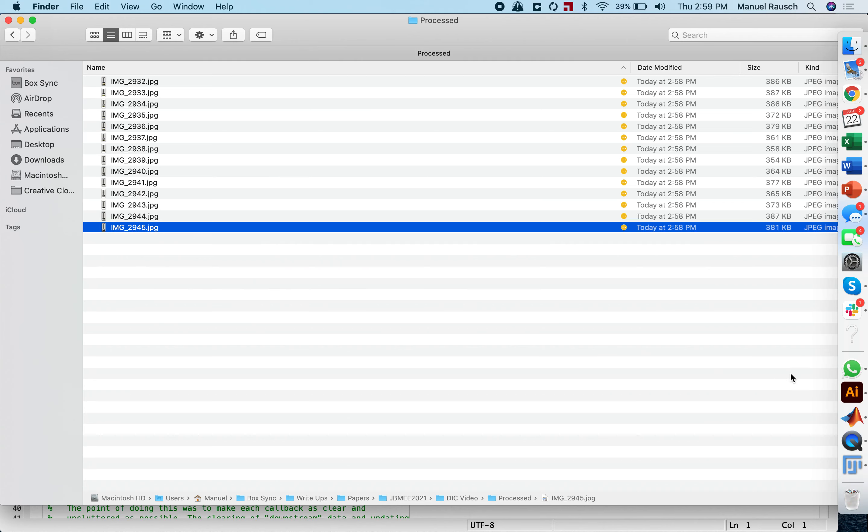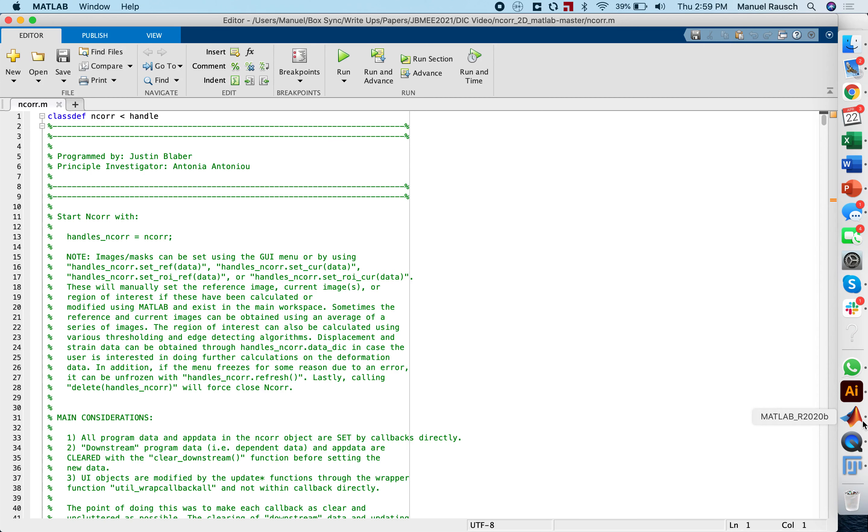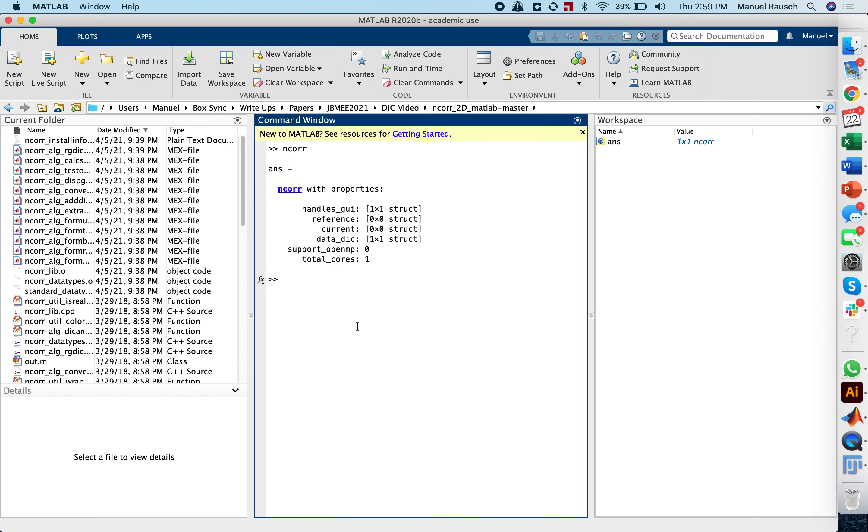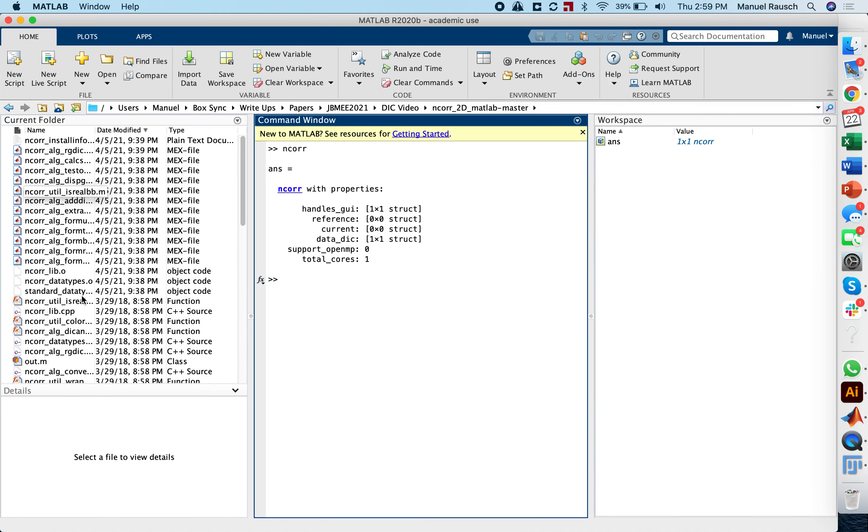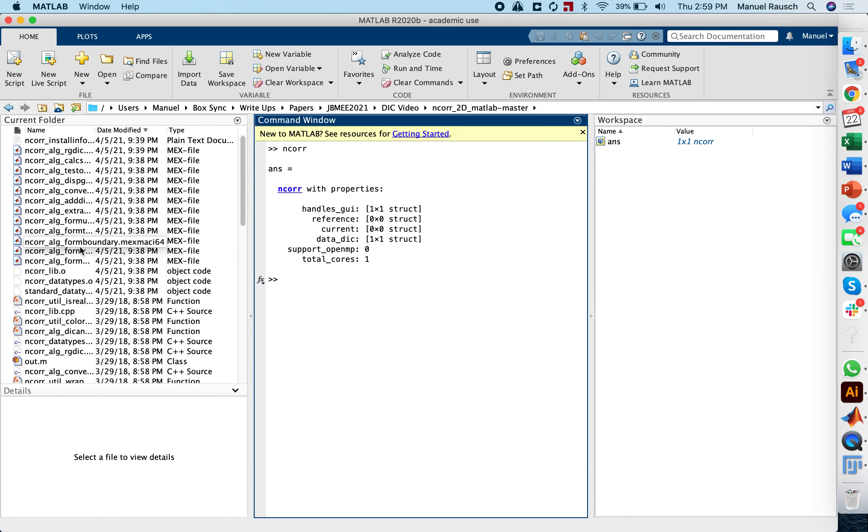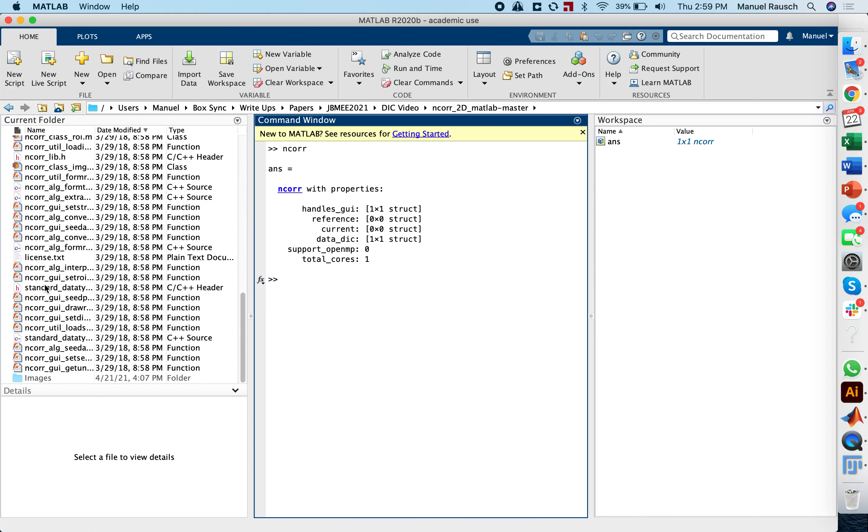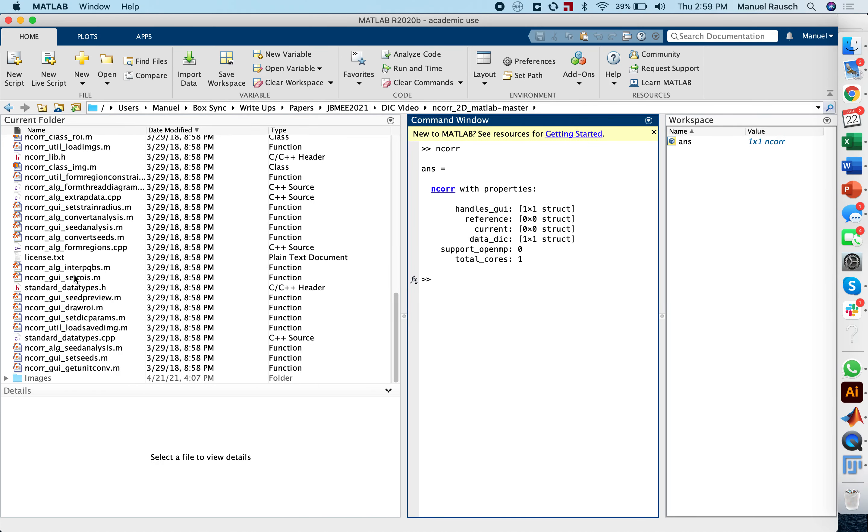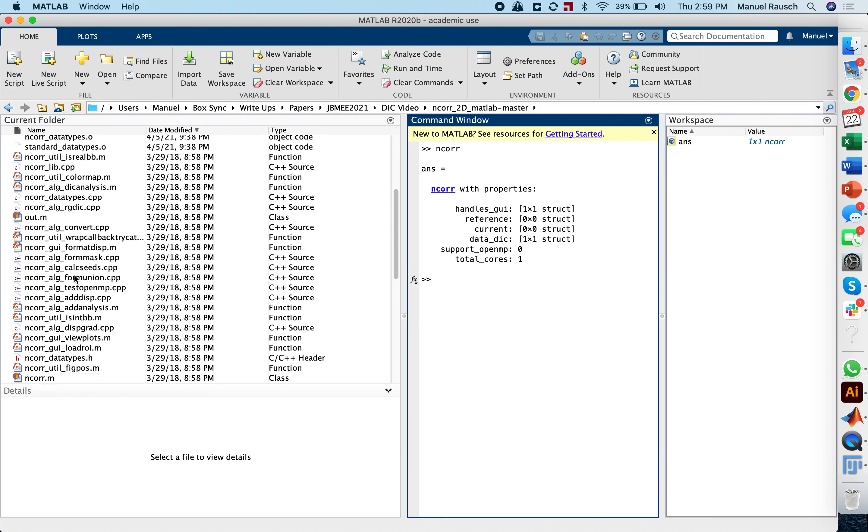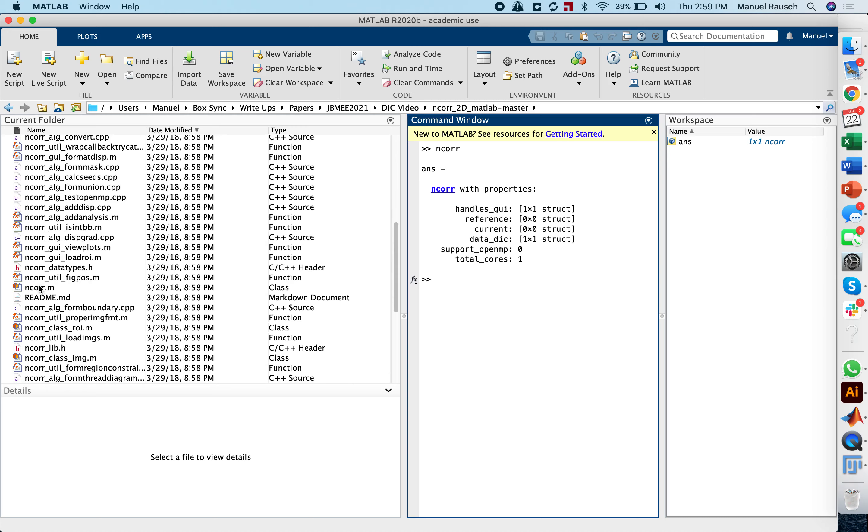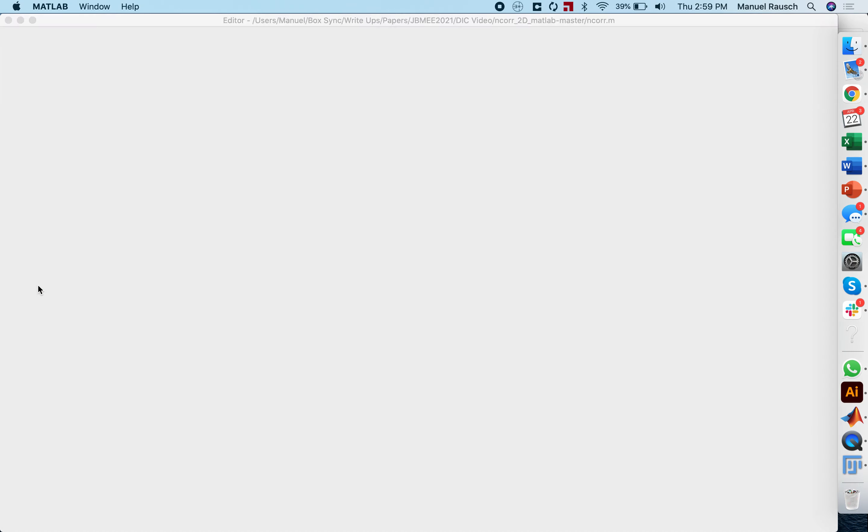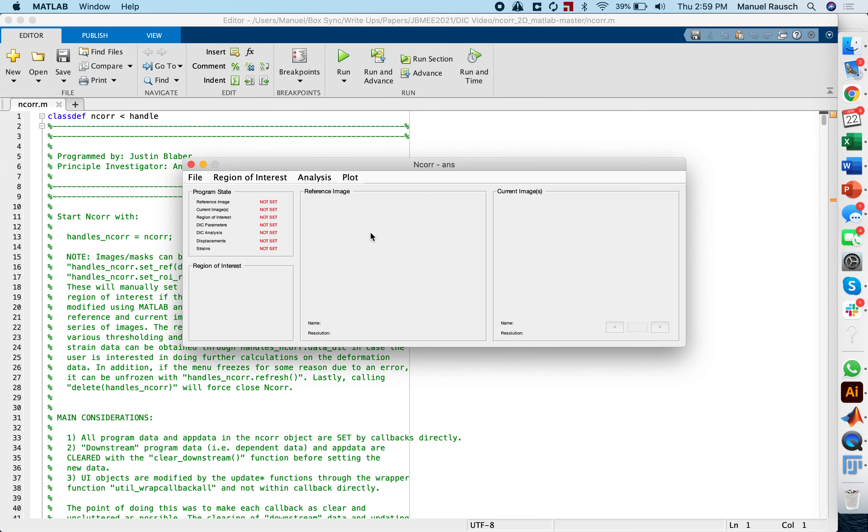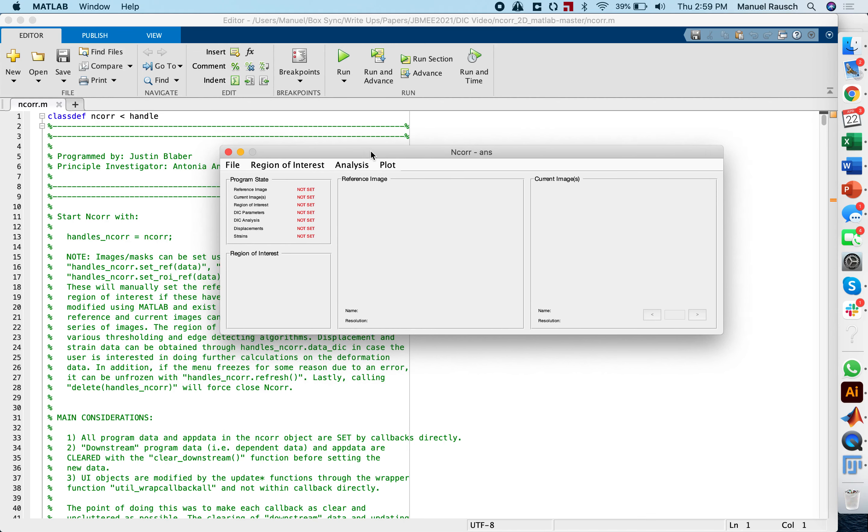The next step is now to download the software called Ncorr. I have provided a link for Ncorr in the original description for this project, as well in the paper describing it. The website is www.ncorr.com, and download instructions will be available on that website. Once you've downloaded the program, you can start it. This is a MATLAB code. You can press play, and you will have this little GUI that will guide you through this process of digital image correlation.